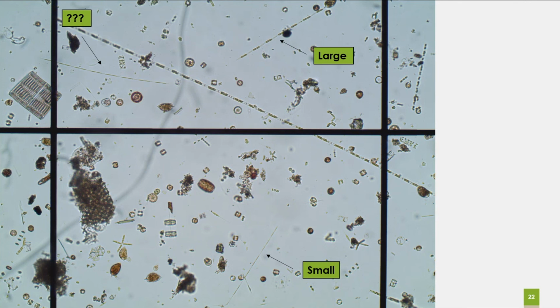Because I need to count each one of these. There's maybe 8 in this chain here. And usually when I'm counting, there's usually 2 chloroplasts and then a clear center. So I'll count that section of chloroplasts and there's a big break. Then I'll count the next section of chloroplasts. I'll show you another example.